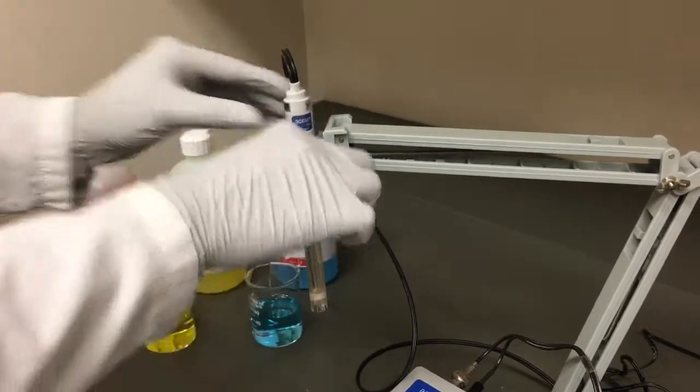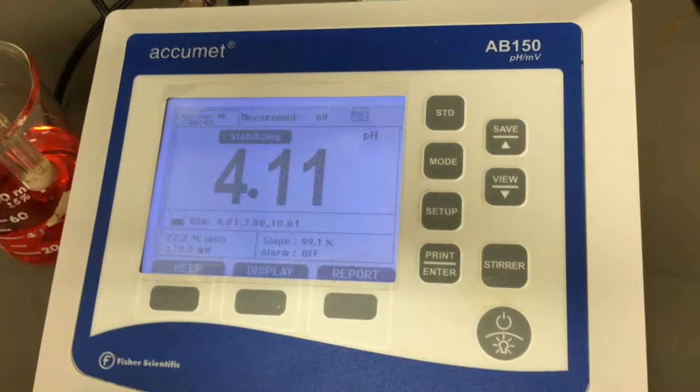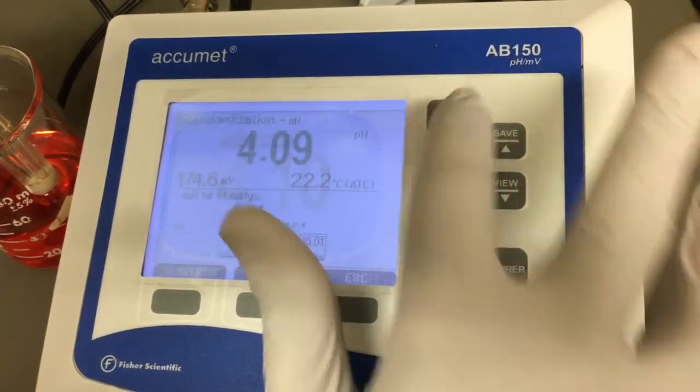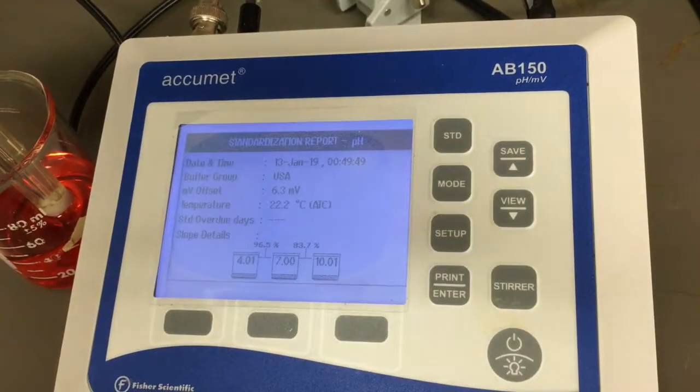Suspend the probe in the holder and submerge it in the first buffer ensuring you do not hit the probe and damage it. Press the standard button and await a stable reading. Confirm the calibration value by pressing the standard button again.